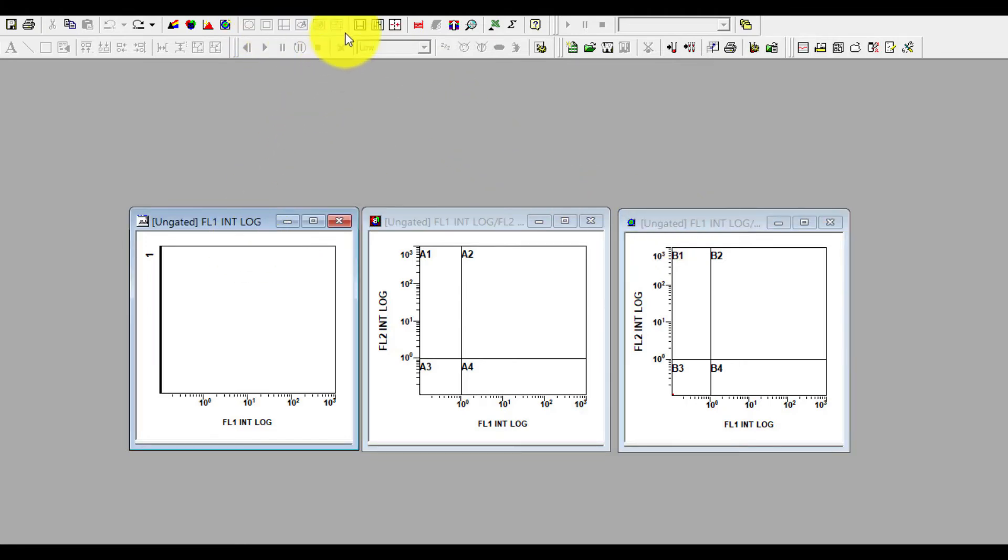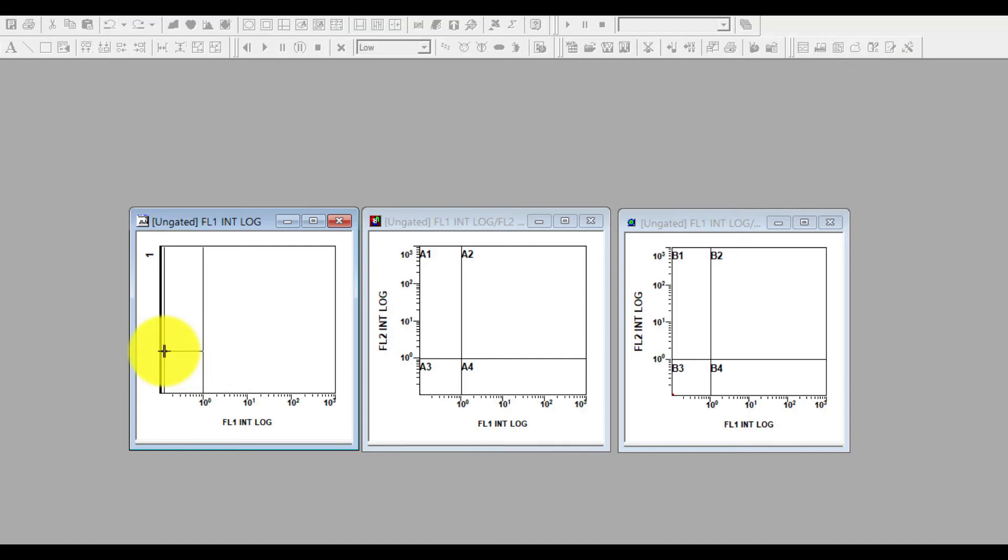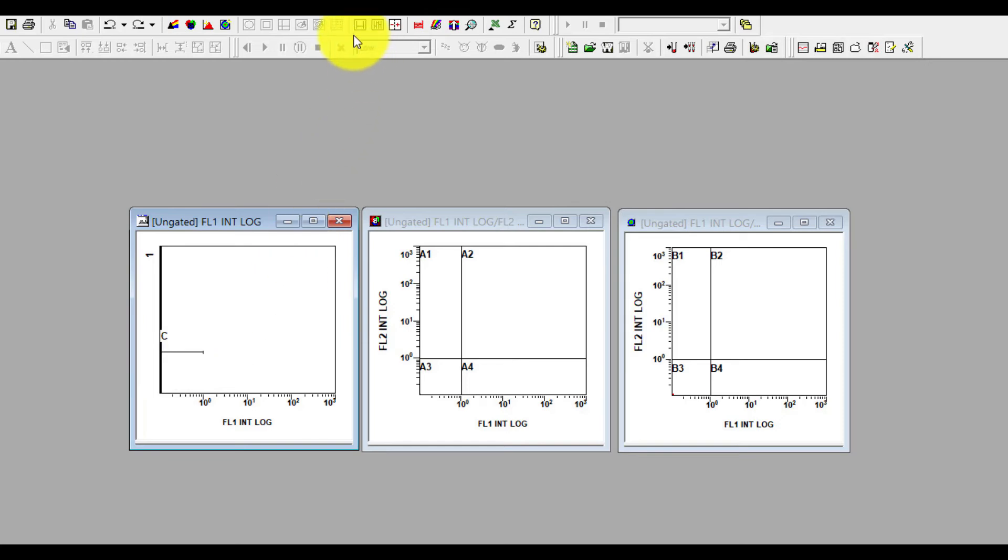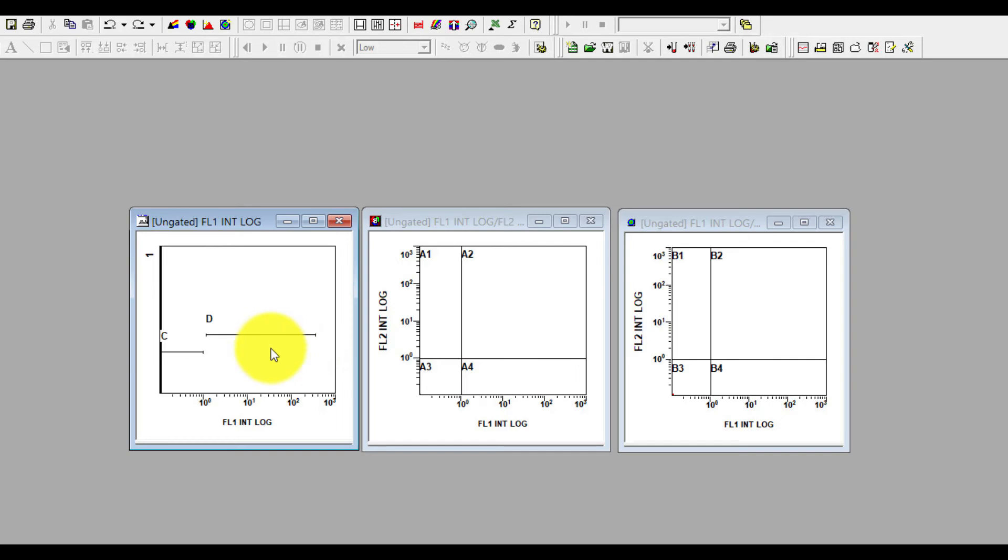Click on the linear region. So 10 to the power 0, below is negative. You will make one region on that side, click on it. And then you have to make another region which will be most probably your positive population area. Drag it, click on it, and you can adjust the size according to your cell population.